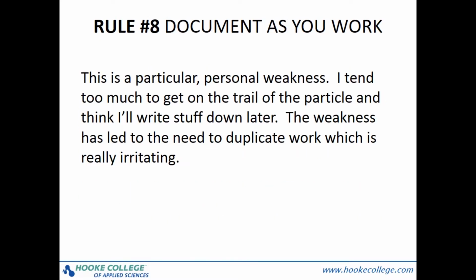Rule number 8, document as you work. I was just never really able to consistently break myself of the bad habit of not documenting as I worked. I'd do okay for a couple of contaminants and then I'd get in a rush or get too curious to know the answer, like skipping to the end of a good book, and rush to the end. The report writing then was always painful, and I might even have to repeat some work if it had been a sufficiently long time. So, to myself, and maybe if you have this problem, document as you work.